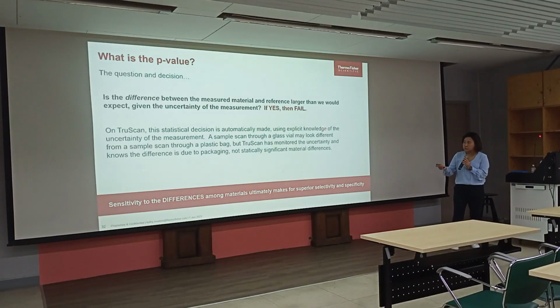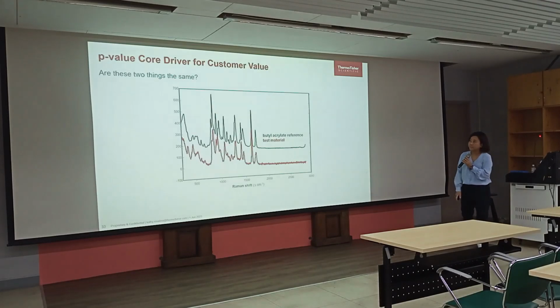This is a description of how the p-value works. So we are sensitive to differences. We do not measure the similarity. I want to highlight that we measure differences.